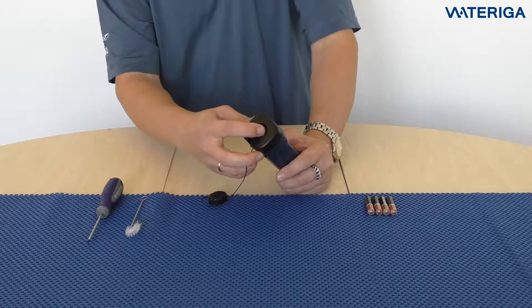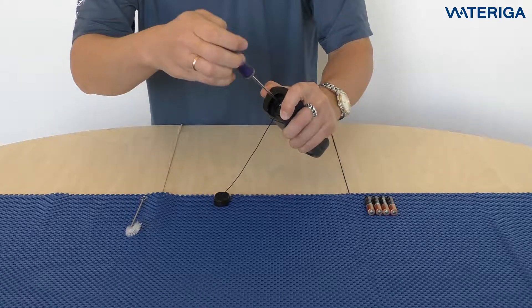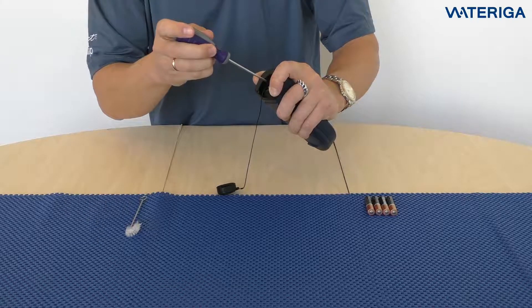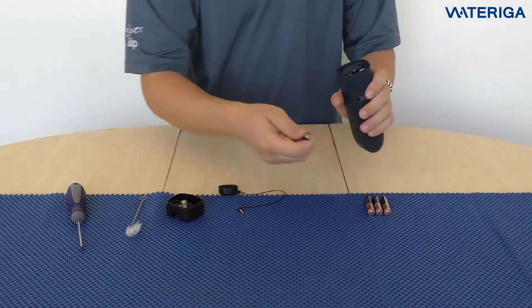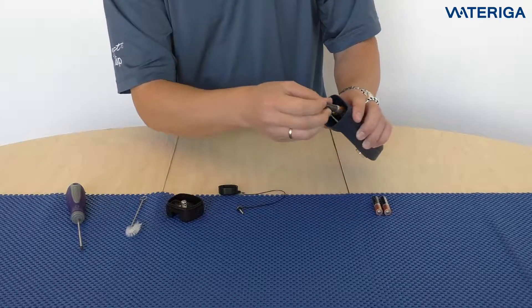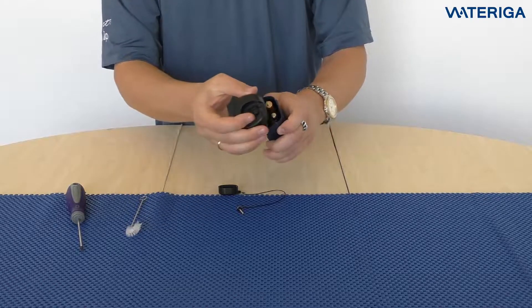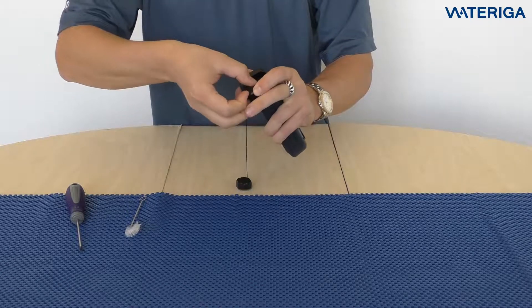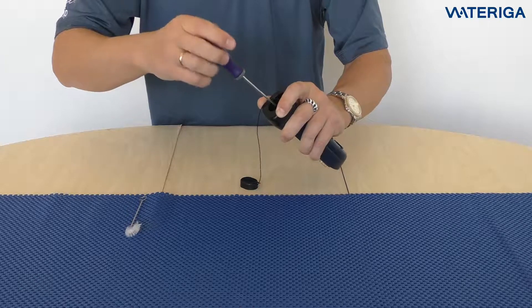At the bottom of the i-Dip you also have the battery chamber. Take a screwdriver and unscrew the little screw here. The i-Dip comes without batteries installed, so when you buy it you need to get standard AAA batteries. Remove the cap — there's a small schematic to show you how to put the batteries inside: one, two, three, and four. When replacing the cap, hold it down, put the screw in, and screw it in. Don't over tighten the screw, only make it snug.